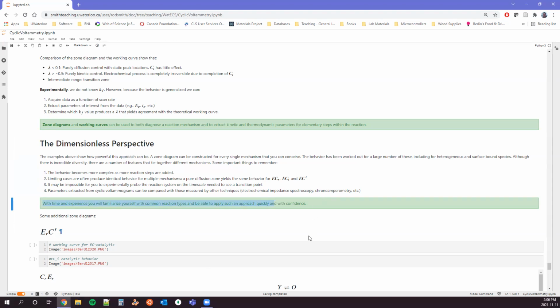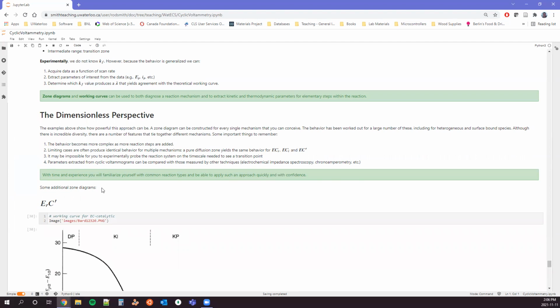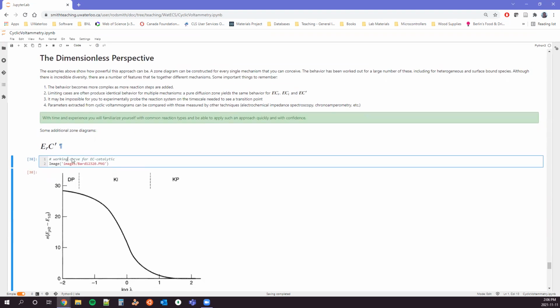The key is with time, familiarize yourself with these things, right? And so look at the different reaction types, look at the expected behavior and consider it. You might have to extend your scan rates far beyond what you're comfortable normally doing, right? A lot of people will do cyclic voltammetry between 10 and 100 millivolts per second and call it a day. You might have to go faster, you might have to go slower, right? And so I've done them before at 100 microvolts per second to see behavior clearly. And it really gives you that extra bit of information that you need to diagnose a mechanism.